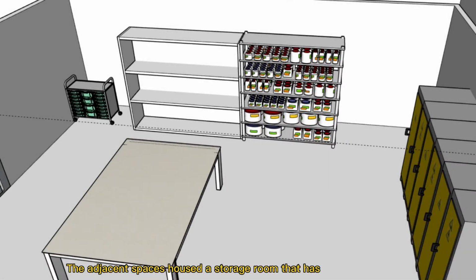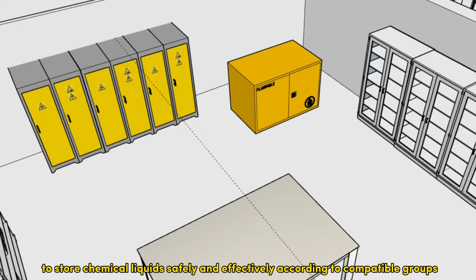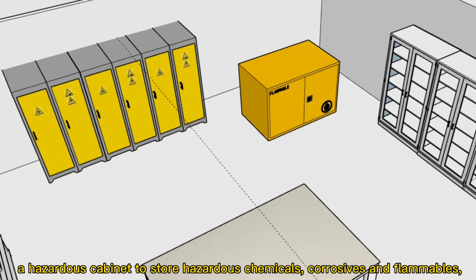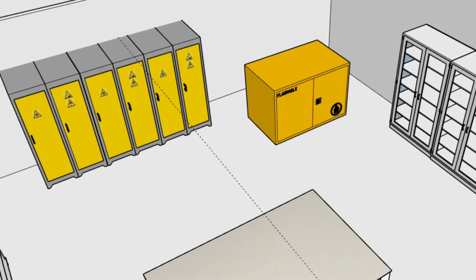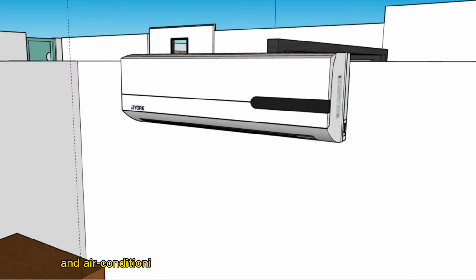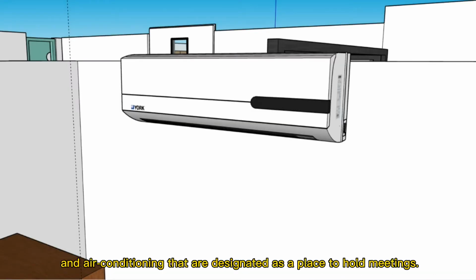The adjacent space houses a storage room that has a chemical cabinet to store chemical liquids safely and effectively according to compatible groups, and a hazardous cabinet to store hazardous chemicals, corrosive and flammable. Next, we have a meeting room consisting of a bookshelf, projector, whiteboard, cabinet, and air conditioning. They are designed as a place to hold meetings.